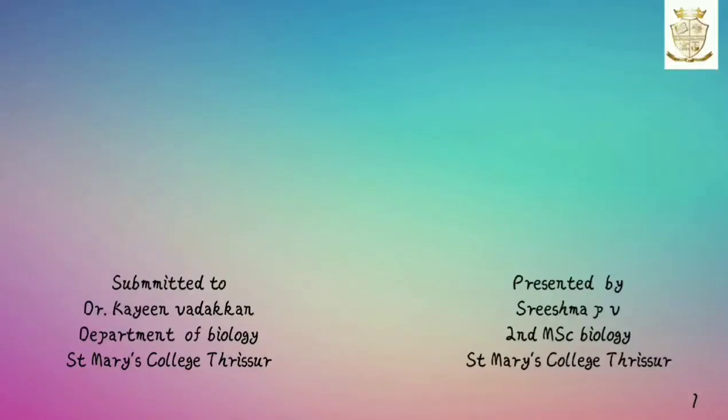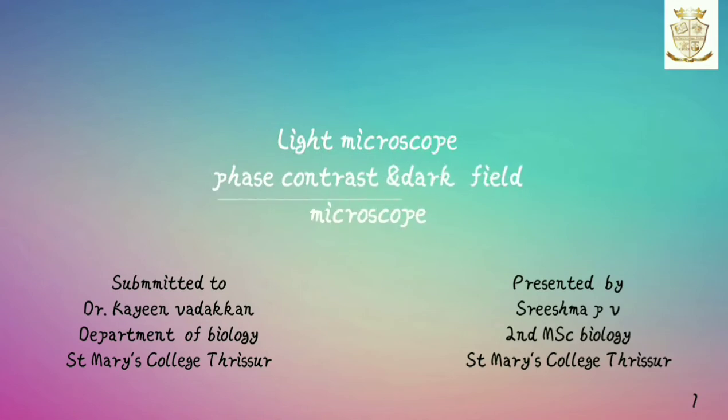Hi everyone, now we are going to discuss what is a light microscope, the phase contrast and dark field microscope.